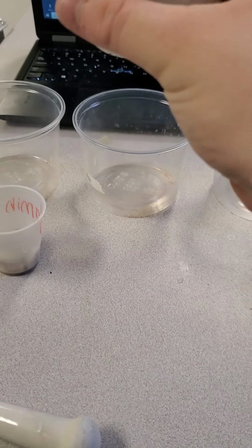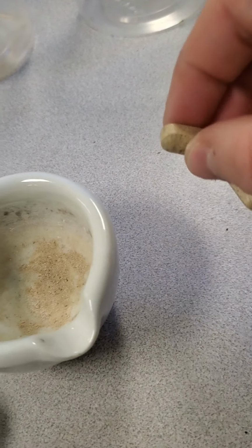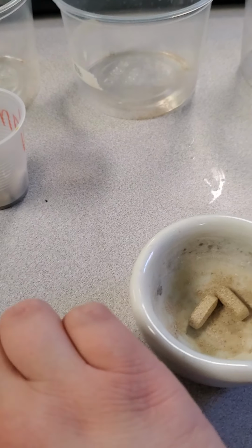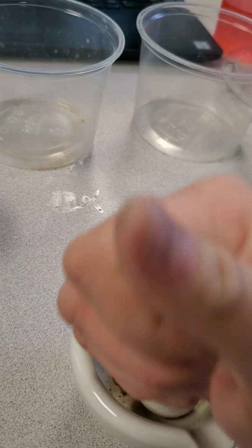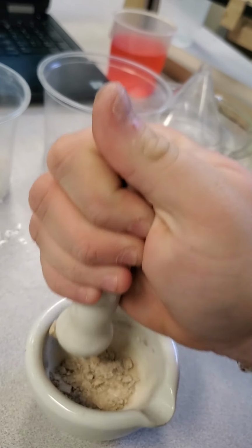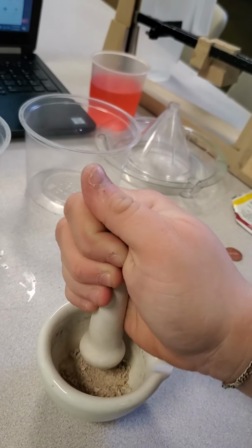Okay, we're going to start off. I have a mortar and pestle. What I'm going to do is put 2 vitamin C tablets, which are each 500 milligrams, in my mortar and pestle, and crush them into a powder. We want it to be as fine as we possibly can so that it easily is able to dissolve.